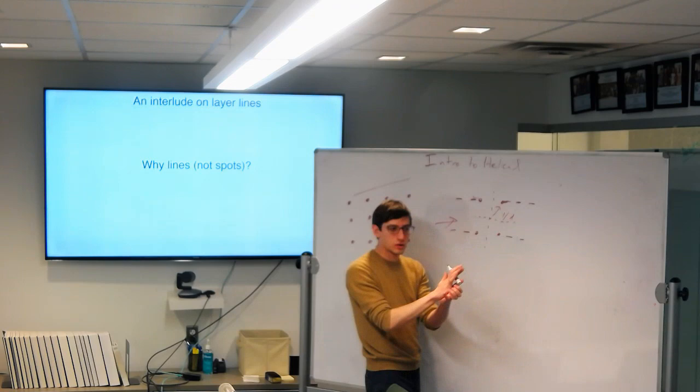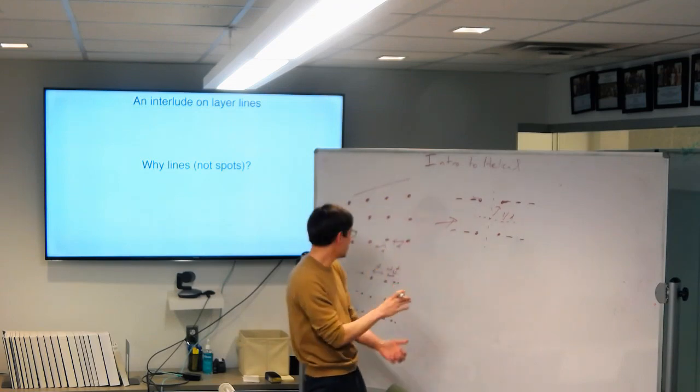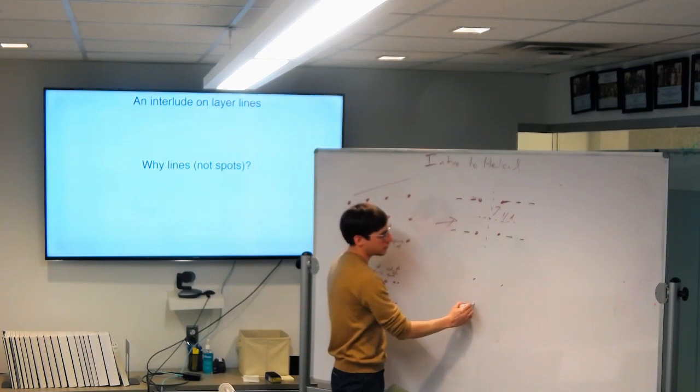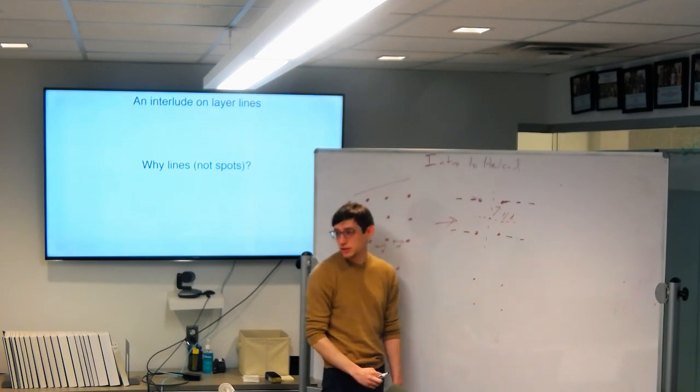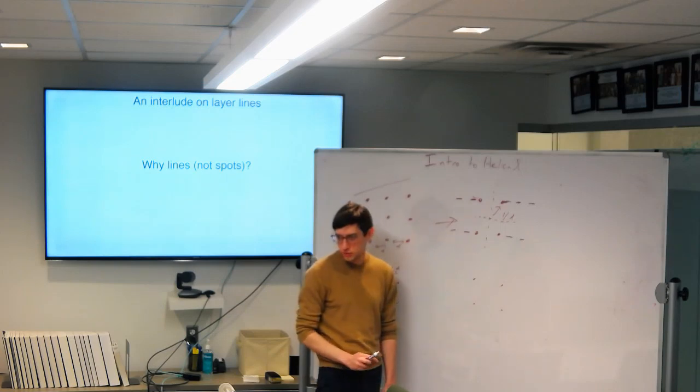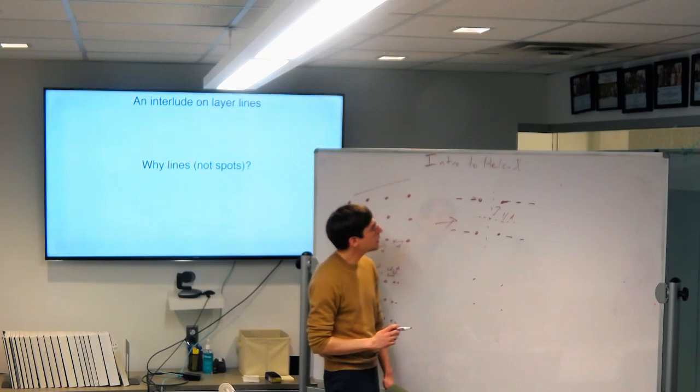If you squish the tube, if you make the tube flat, then you just have the two lattices on top of each other, and you will just get spots. So that tells you your tube is bad, and you don't want to process it if it's not round. And that's a common symptom in, for instance, negative staining of helical tubes.